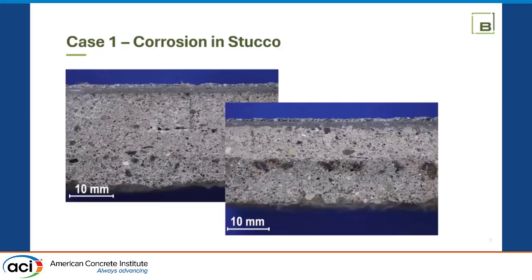So I did the fun thing, and I whipped out my portable X-ray fluorescence, ground things up, and I was playing with it, and I noticed that the detector has software built into it for the chloride analysis. And usually my number comes out at 1250-ish parts per million, or 0.125%. But when I'm close to that value, it tends to drop to 1,000 parts per million. And that's exactly what happened. It went down to approximately 1,000 parts per million, the detection limit for the software.